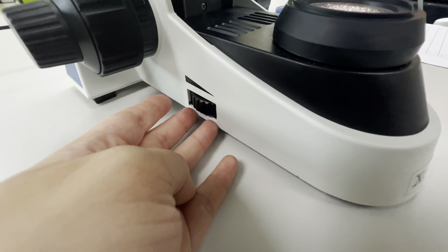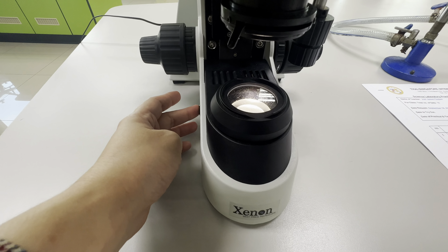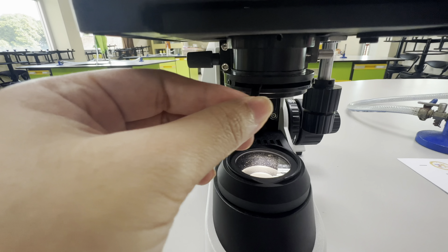This is the light source, or the illuminator. It makes the specimen easier to see by giving light. You can adjust the brightness according to your preference using the knob on the side.